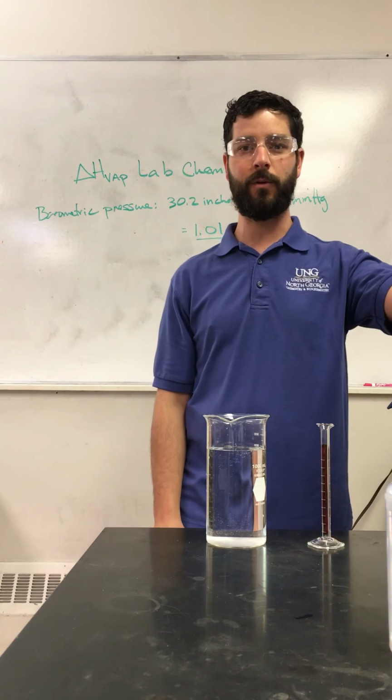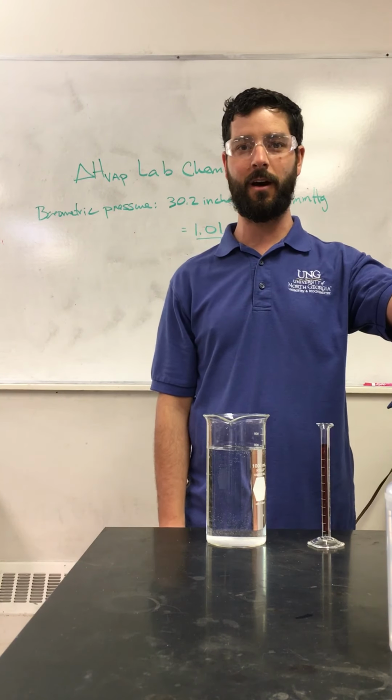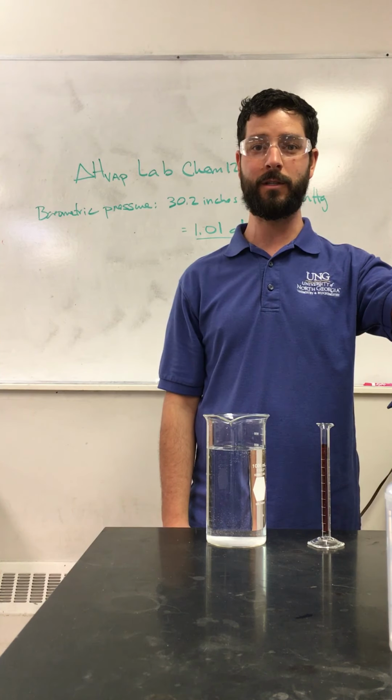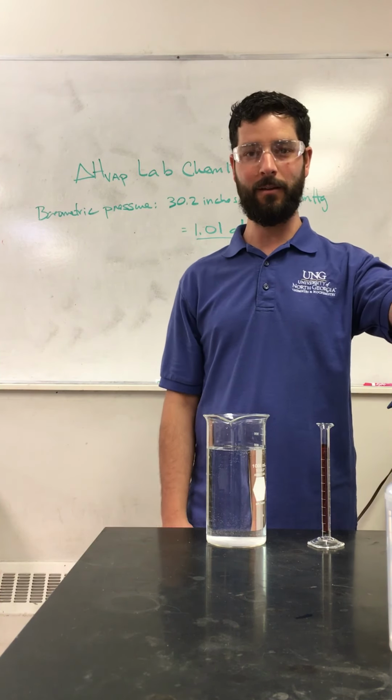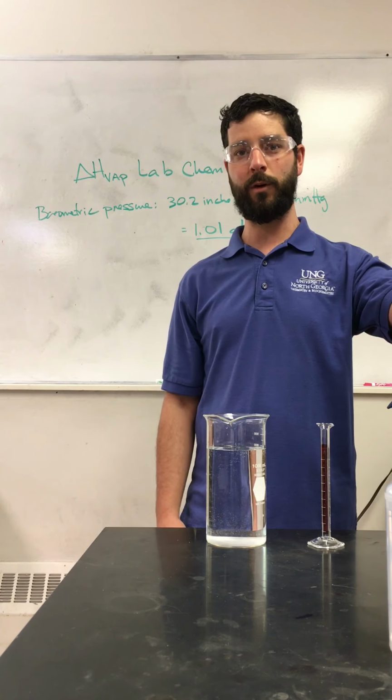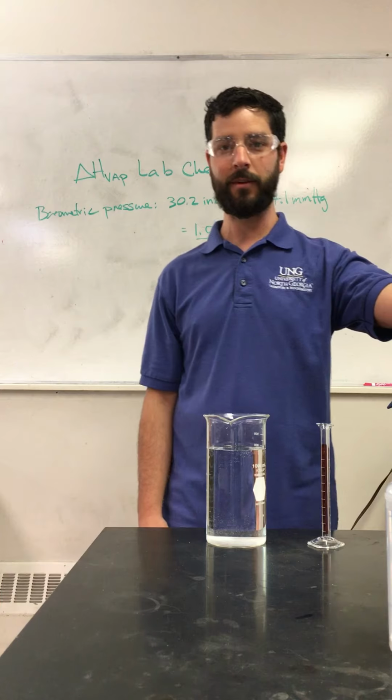Chem 1212, welcome to the online demonstration of our first lab, which is enthalpy of vaporization. I am Dr. Roy Stansby Sparks. I'm going to be taking you through this lab demonstration today to give you an idea of what you would have been doing in the lab had you been doing it yourself.